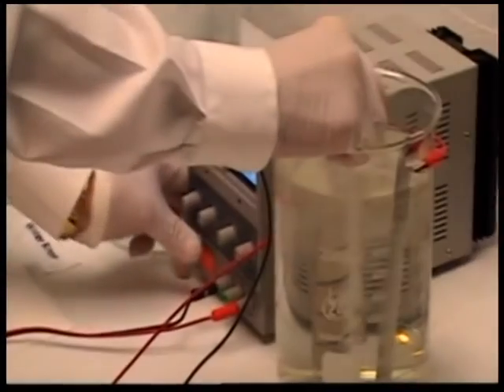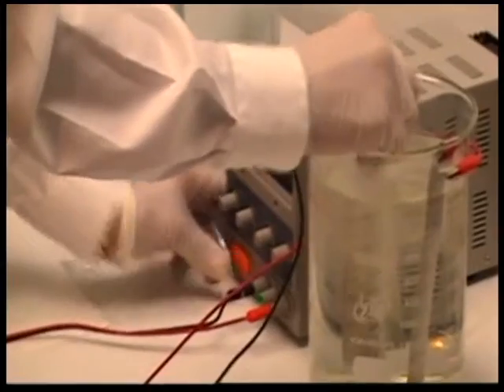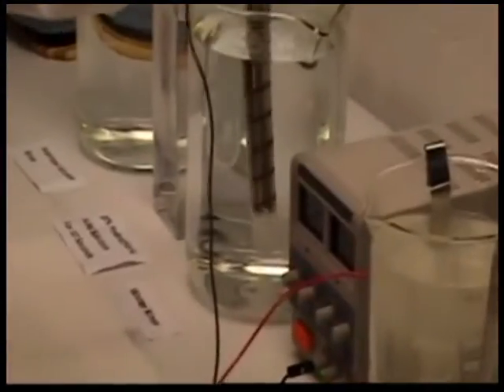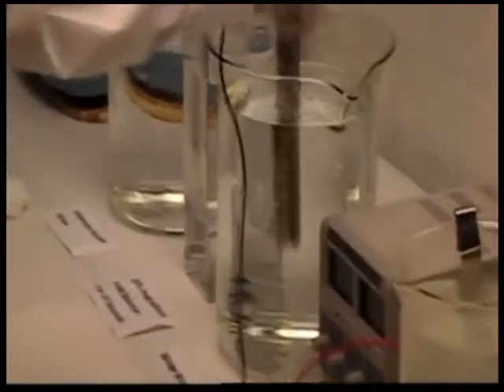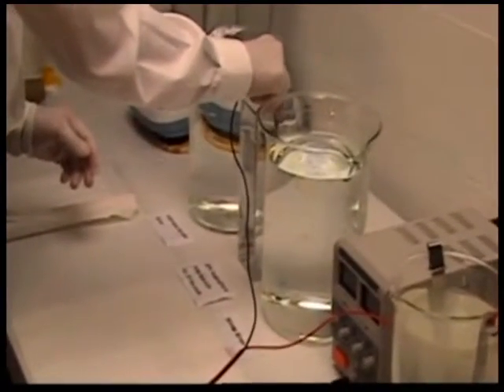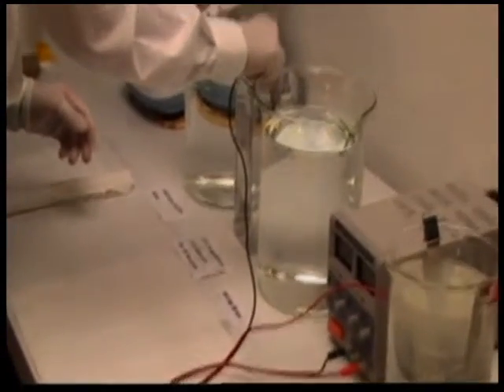Water rinse. Then immerse the helix in a 20% hydrochloric acid solution for 10 seconds.